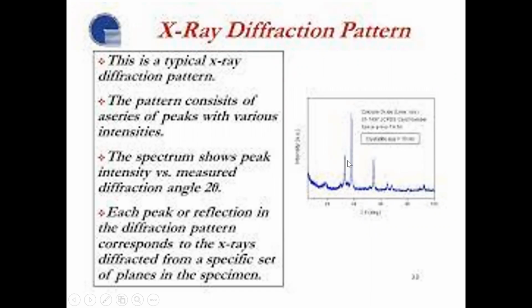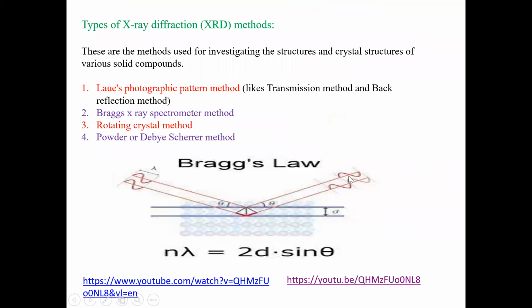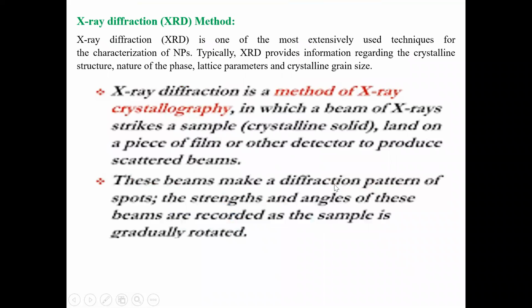So here in the X-ray diffraction pattern, these three successive peaks are there, and these three peaks will give the information about the lattice parameter. This is very important information, and from that we can find out the geometry. FCC आहे, BCC आहे की सिंपल क्यूबिक आहे, त्याचं स्ट्रक्चर काय आहे हे याच्यावरून आपल्याला मिळतंय. इंटेन्सिटी वरून आपल्याला त्याचे फॉर्मेशन्स ऑफ द नॅनो मटेरियल्स ऑल्सो गॉट द इन्फॉर्मेशन. So this kind of informations we get from the X-ray diffractions methods.